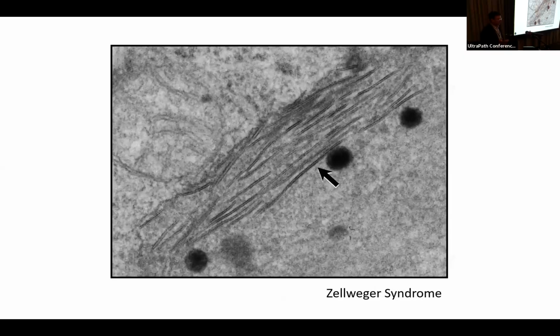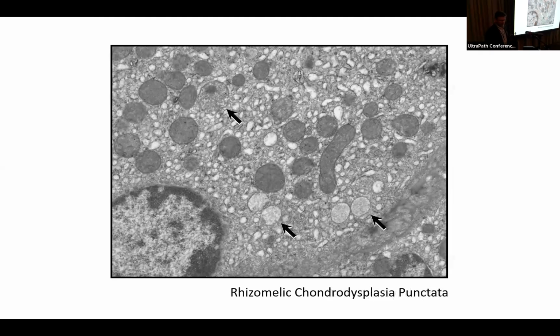These Kupffer cells often will have just loads of these trilaminar leaflets. This is a pretty high magnification. You can see how small these are. This is a mitochondrion up here, right? And so these are accumulated in the Kupffer cells, and sometimes the Kupffer cells will be increased in quantity also.